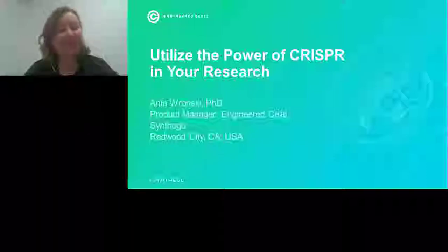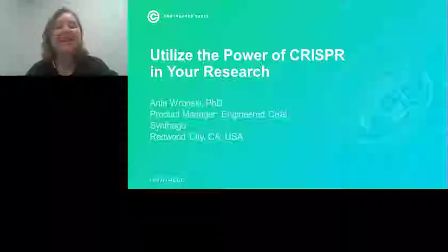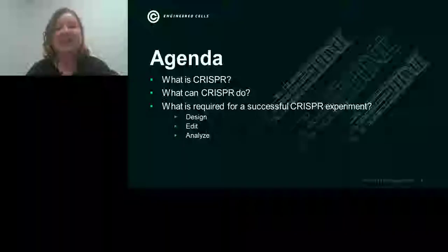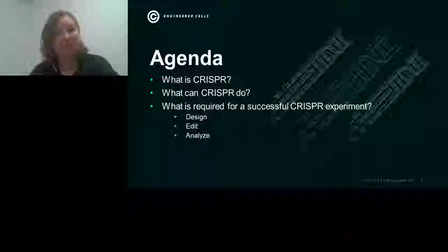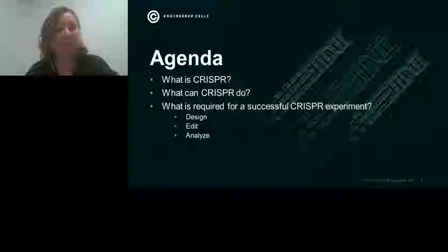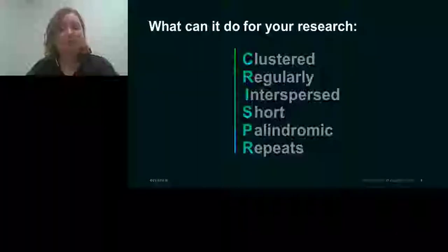Thank you, and it's my pleasure to be speaking to the LabRoots audience to really help people understand how to utilize the power of CRISPR in their research. So what I would like to go through today is what CRISPR is and what it can do for researchers today. It's an incredibly powerful tool. And then also go through what is required to have a successful CRISPR experiment, which is obviously integral to using this tool in your research. So I'll go through how to design an experiment, how to actually conduct the editing, and then how to analyze the results at the end of that experiment, which is obviously pivotal to knowing whether it worked properly or not.